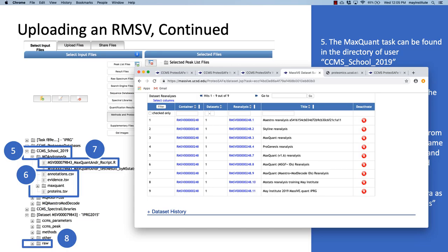And even today, Galaxy is a little better, but not all the way there yet. So we've been keeping an eye as to whether there's other options. Maybe it's pretty much we still have to study. We do a lot of work with Galaxy now. So I think now it also does the auto scale. Yeah, it's more about getting these workflows into it. Because otherwise, if you're going to search 50 million spectra in one take, it needs to parallelize. Otherwise, yeah, exactly.